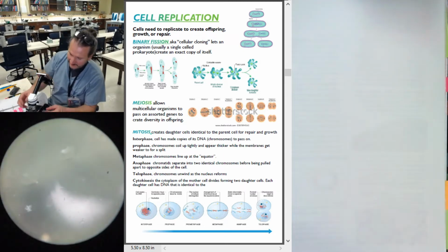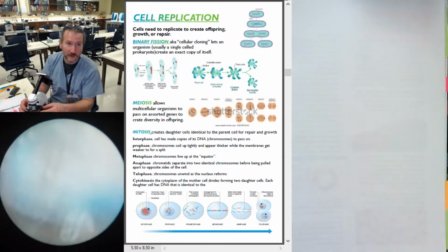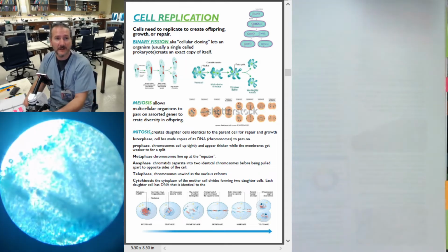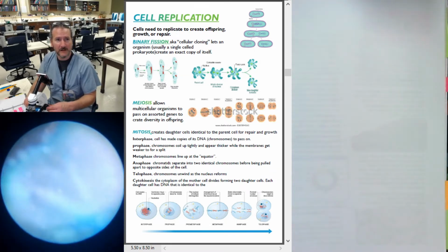What do I see? Nope. Over. Let's see. Underlighting. Overlighting. Way overlit.